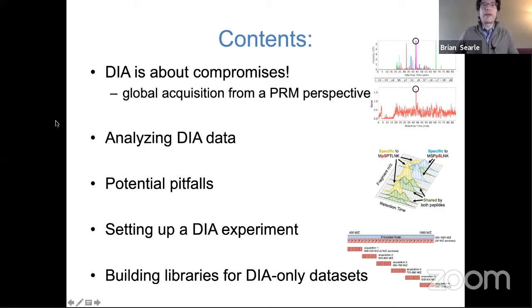Again, this is one of the reasons why accurate mass and time tag methods, like how the Matthias Mann group has been doing these, and Dick Smith's group did these 15 years ago, where you would actually have very narrow precursor isolation windows, where you were just collecting very high quality precursor scans. This is the reason why those types of methods work.